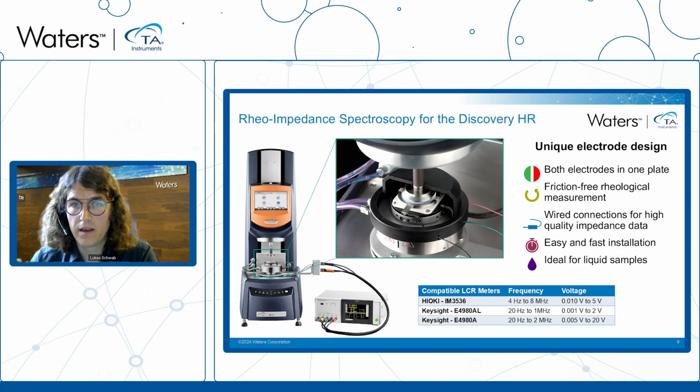But then the unique feature is how we arrange the electrodes, because now the electrodes are not separated in the top and the bottom plate, but both electrodes are combined in the lower plate of this setup. So this means the lower plate is split in two halves, one connected to each electrode of the LCR meter, and they are separated by a ceramic insulator here in the center.